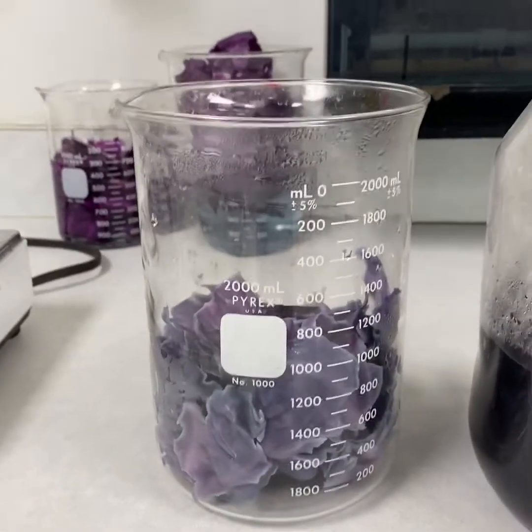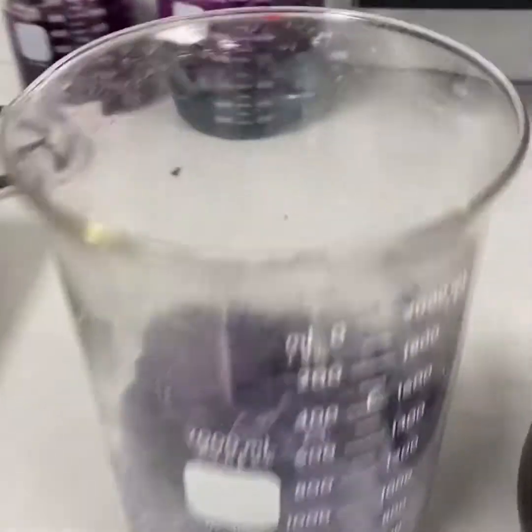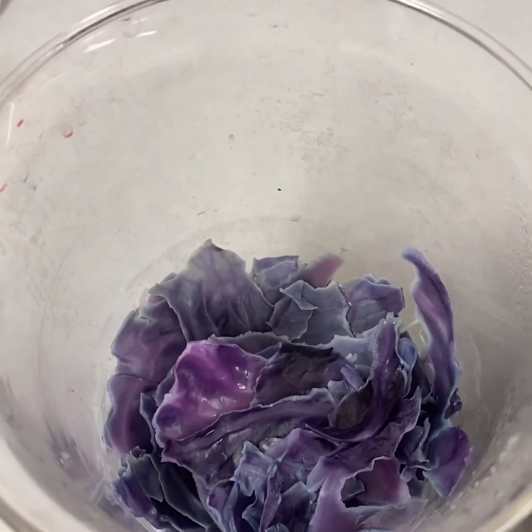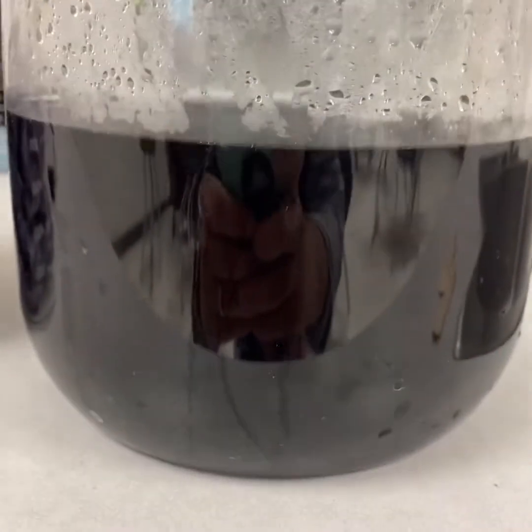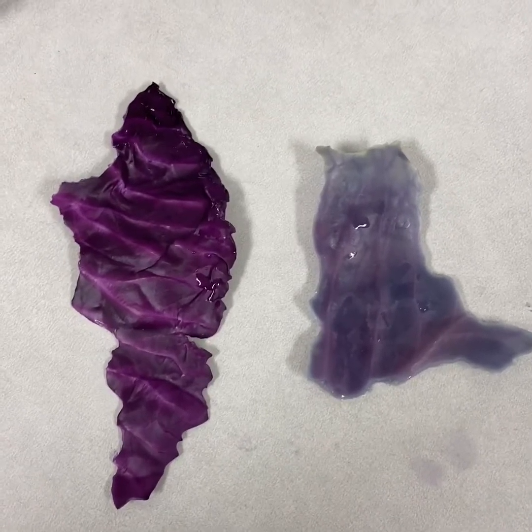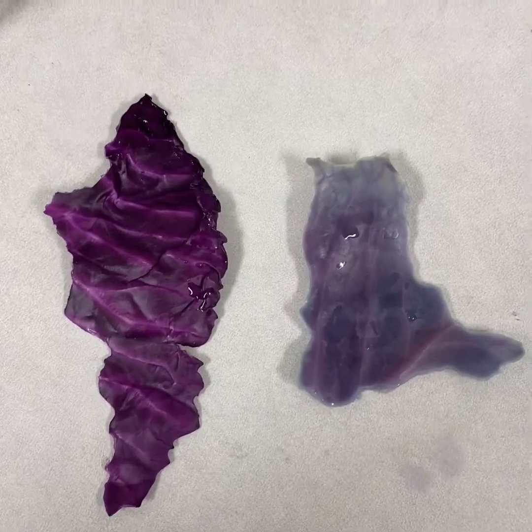As you can see, I've taken out all of the purple liquid, and what's left behind is our cabbage, which has lost its color. Over here is our deep purple indicator liquid. Here is a reference to show the before and after of our cabbage after it has boiled.